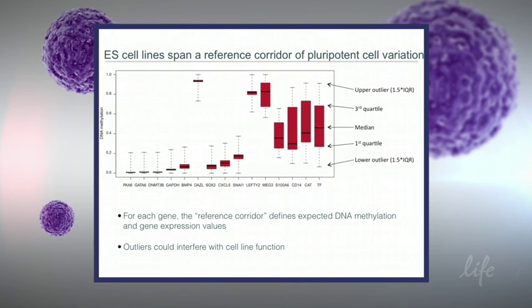And so we can actually take advantage of this, because this is for the 15 genes, as I showed you before, we have this for the entire genome. And so now you can define a range which you find as an acceptable range, and then easily define outliers that are sitting outside of that range as not fitting your standards for, in this case, DNA methylation, but again, the same is true for gene expression.